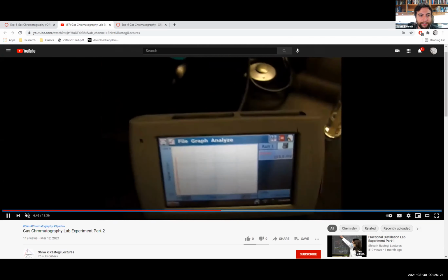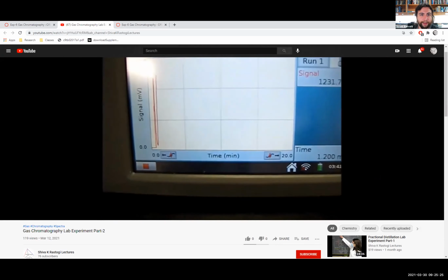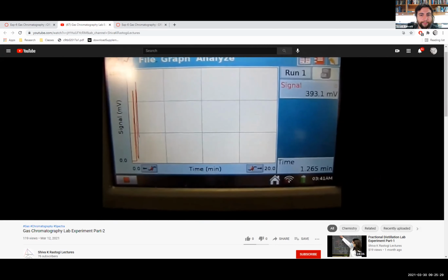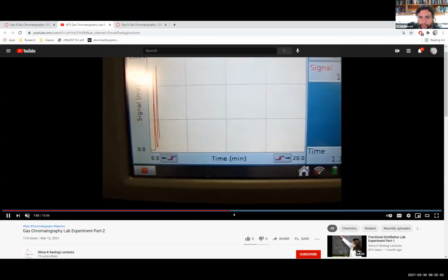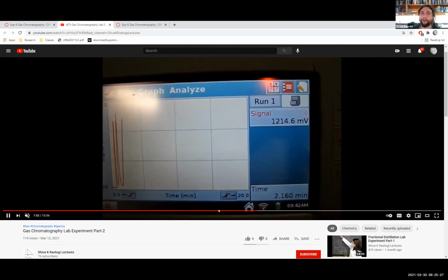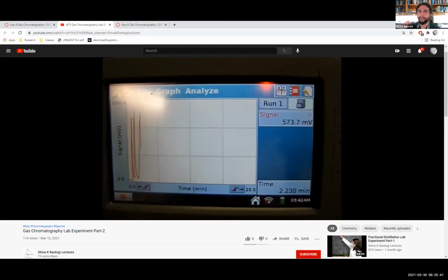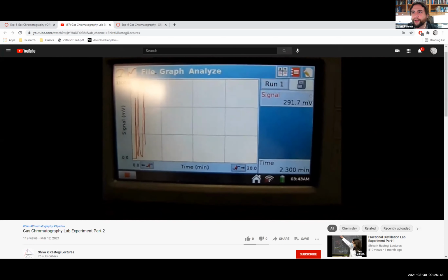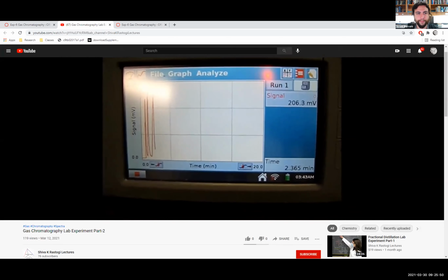So we can skip ahead to 6:54. So here's our second peak, shoot straight up again, and it's going to come right back down. Okay, and then our third peak is going to be at 7:55. So I'm going to jump ahead to there. So you see there's a lot of waiting involved within this too. It's a lot different in lab when you're processing this and utilizing the machine in order to perform this experiment. But we finally get our last compound within our ketone mixture.